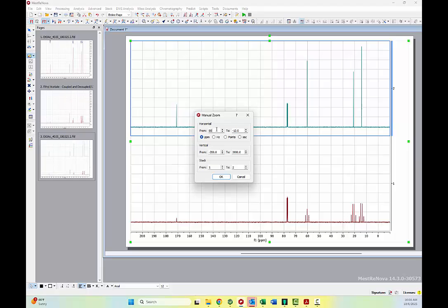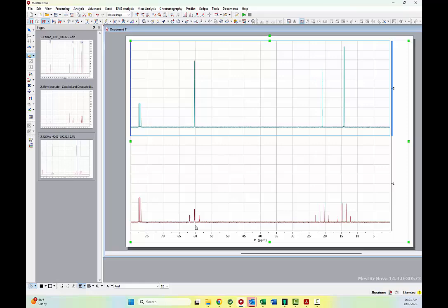One last thing I want to illustrate for you here by changing the zoom is that you can see that the peaks end up in the identical location in both cases. So our triplet, this singlet now ends up at the center line of that triplet. The singlet ends up again directly in the middle of this quartet. This singlet ends up directly in the middle of this quartet, and so on. So the peak location is identical no matter how many lines the peak has. It's just, again, in practice, better to collect this information that allows us to plot the C13 spectra as singlets as opposed to multiplets.